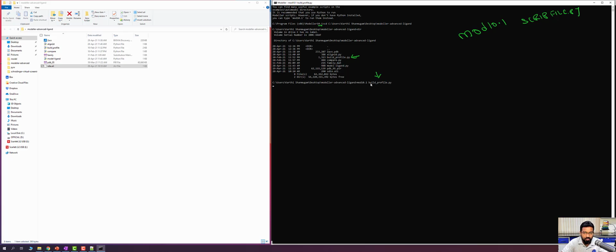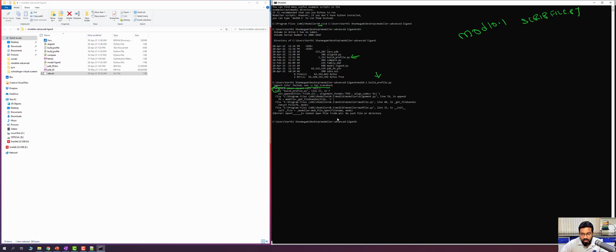So it may take a couple of seconds for finishing this. So if you get this import site failed use -v traceback, no need to worry about that. Okay, this is not an error, which means that it is running. Okay, so we have to wait for the completion of the process. Also you can see here the cursor is blinking, which means that the program is running. So once it stops blinking and the line is terminated and the next line appears like C:/user/Karthi Shanmugam, that means that the process is over.